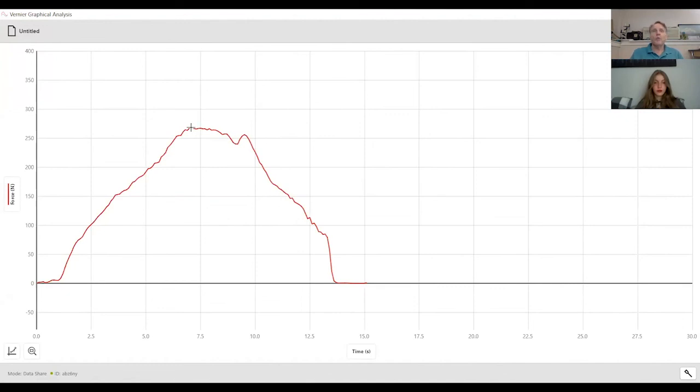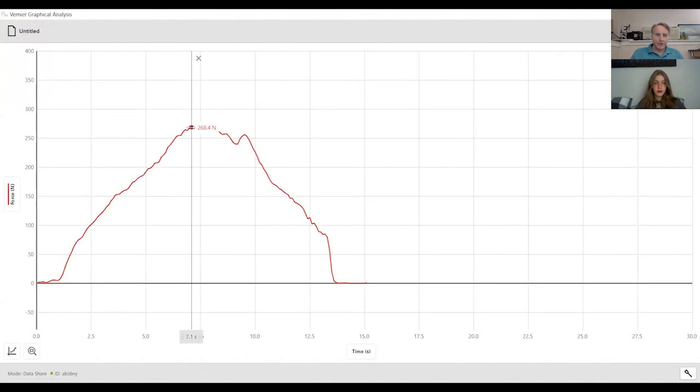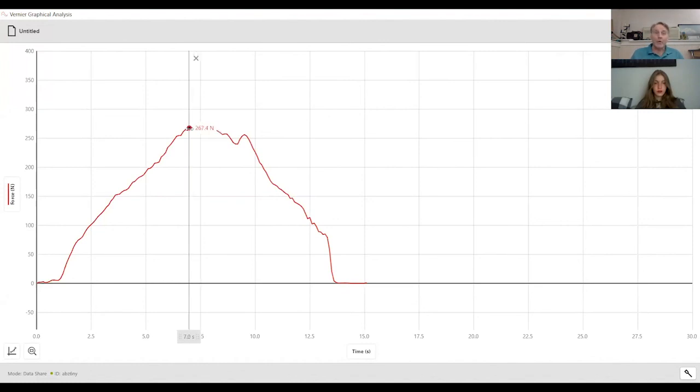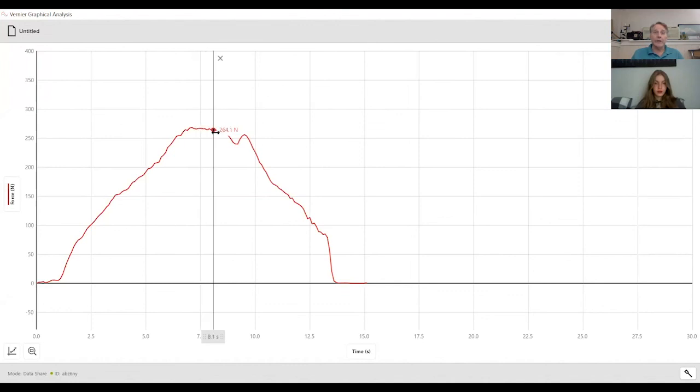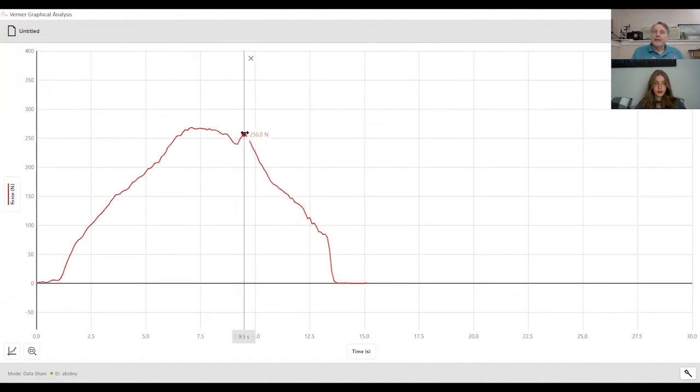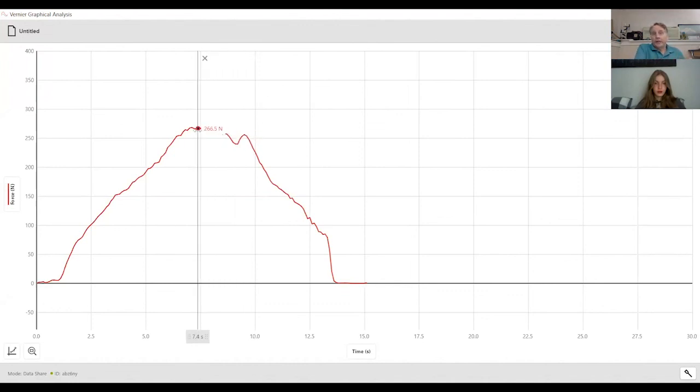Maybe she can find a point up there someplace. Maybe she scrolls back and forth a little bit to figure that out. So she's analyzing the data that I had sent her.